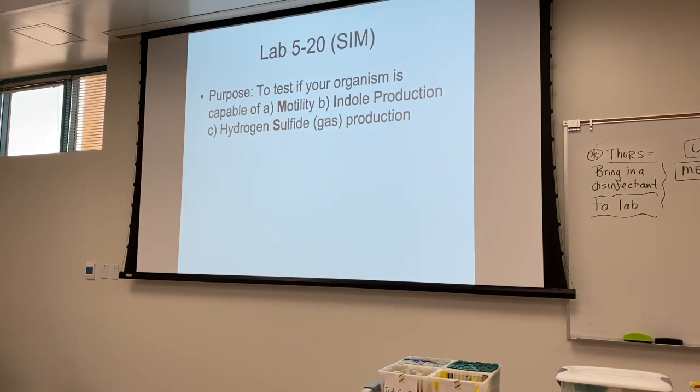As far as what's in there, what's nice is we don't have a lot of pieces in here. So it says digested casein, which is basically our peptone in there.